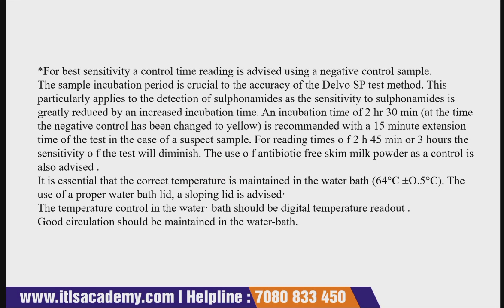It is recommended that you extend the incubation time from 2 hours 30 minutes by 15 minutes more. For a reading time of 2 hours 45 minutes or 3 hours, the sensitivity of the test will be diminished. The use of antibiotic free skim milk powder as a control is advised.